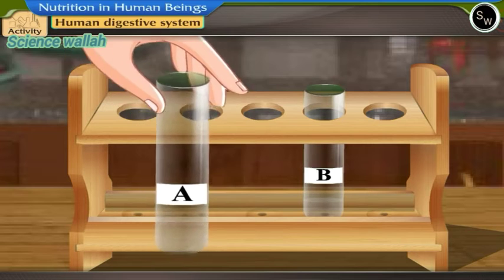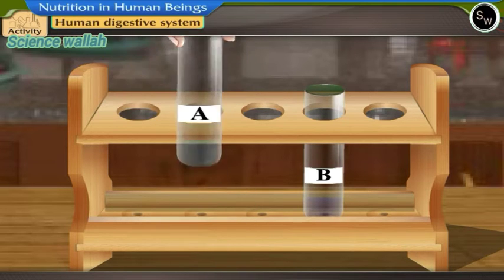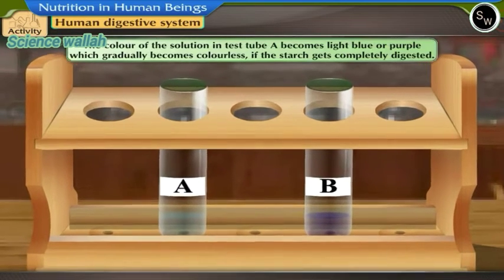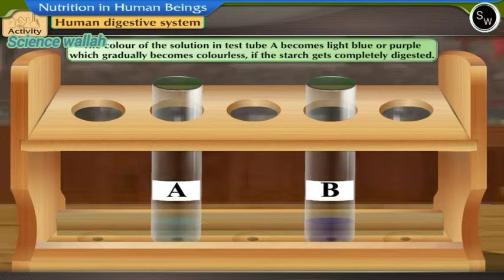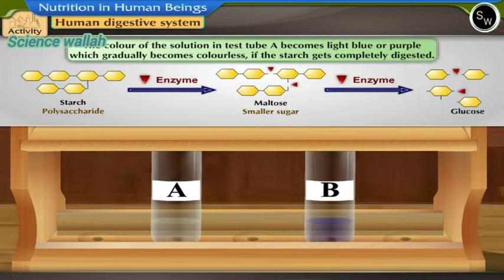Shake well and observe the color developed in the test tubes. The color of the solution in test tube A becomes light blue or purple which gradually becomes colorless if the starch gets completely digested.